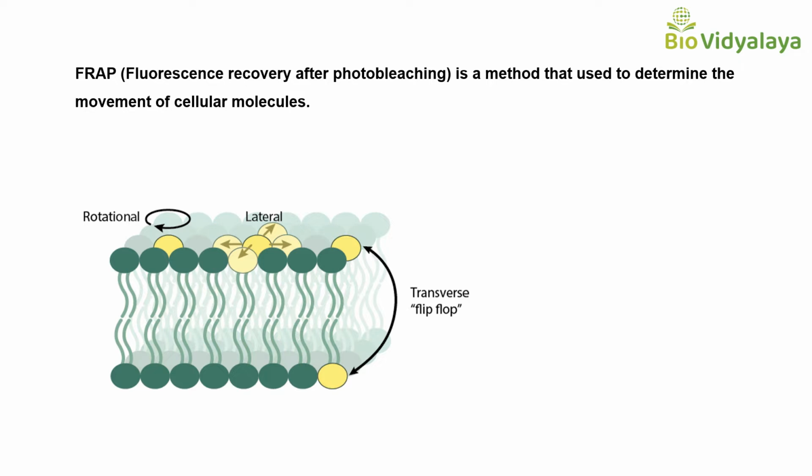FRAP means fluorescence recovery after photobleaching, and this method is used to determine the movement of cellular molecules. That means it is used to study the mobility of biomolecules.